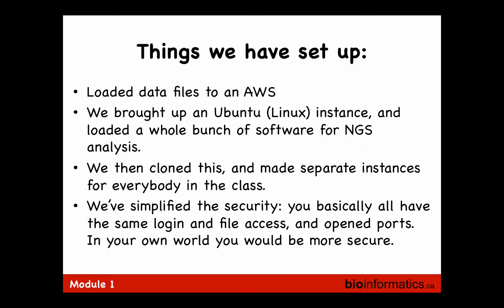Once we had set up, we loaded the data files to AWS, and then we brought up Ubuntu. Ubuntu is one flavor of Linux. We brought up an Ubuntu instance, and then we loaded a whole bunch of software for NGS analysis. Then we cloned this and made a separate instance for everybody in the class. We also simplified the security, so everybody has the same login credentials to log into our instance.